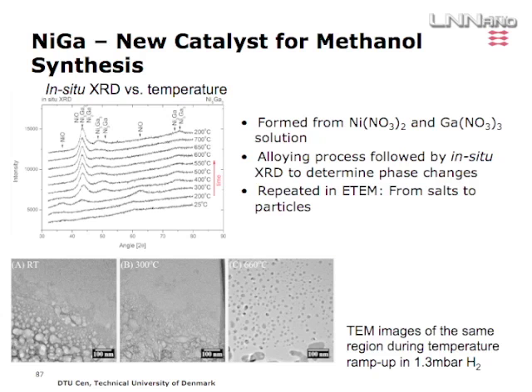Same thing we tried for a nickel gallium system. We tried to do the synthesis in situ in the microscope. First of all, we tried to do it in our in situ XRD setup, where we deposited the salts in the sample holder and then heated it up in hydrogen, as far as I remember. And gradually, you could see these nickel gallium phases starting to form as you increase the temperature in the XRD. So we said, okay, let's try to repeat it in the microscope and see what happens.